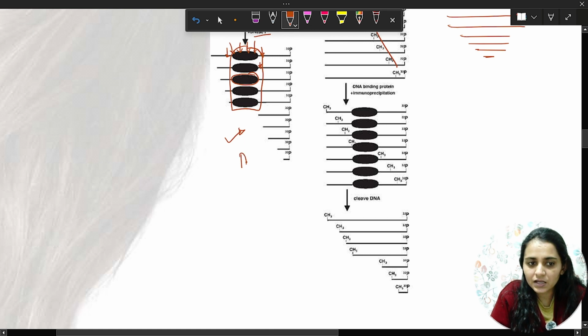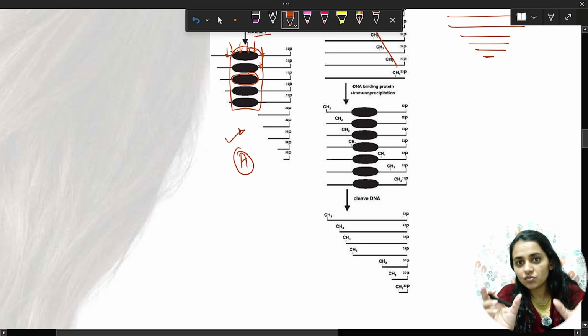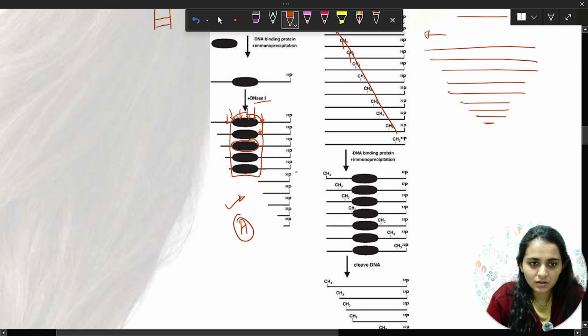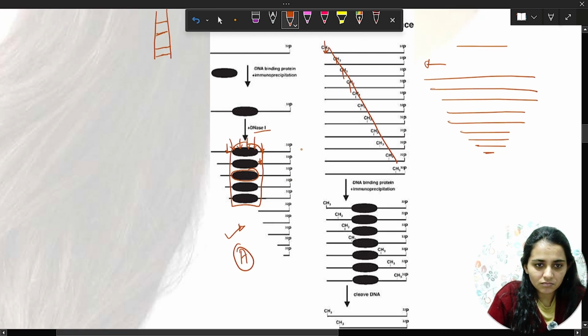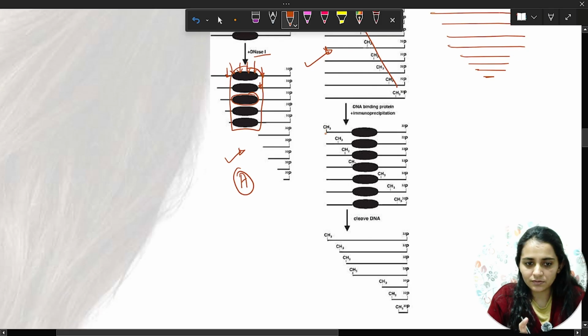We are comparing one strand where protein is present, and we run two parallel gels, one with protein on the DNA and one where we remove the protein from the DNA, and then we run the electrophoresis. That will be this type of result if there is no protein present.